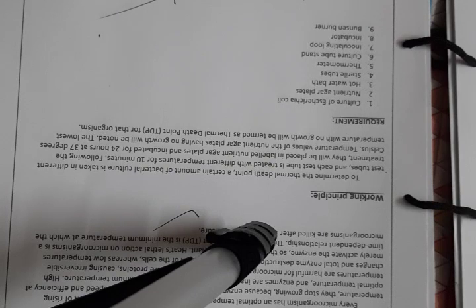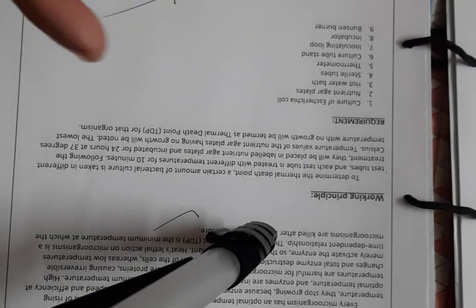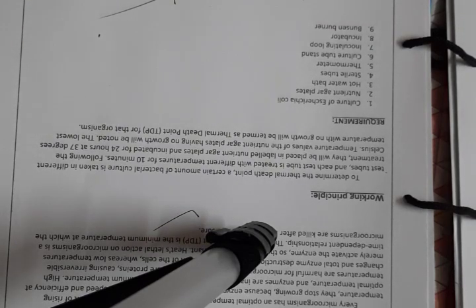And then we need a loop, an inoculating loop, to transfer the bacteria from the test tube to the petri dish, the nutrient agar plates.